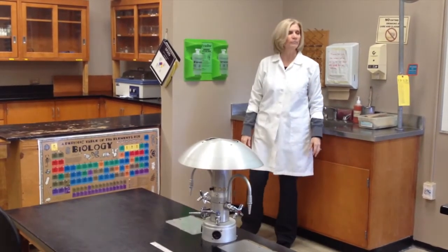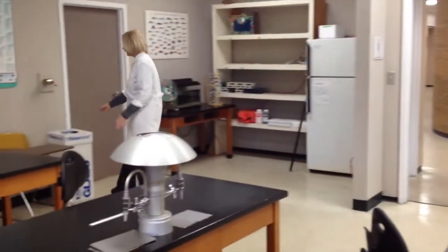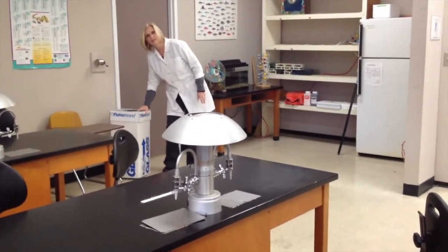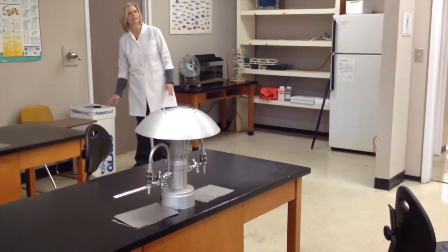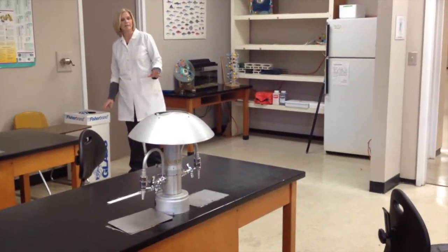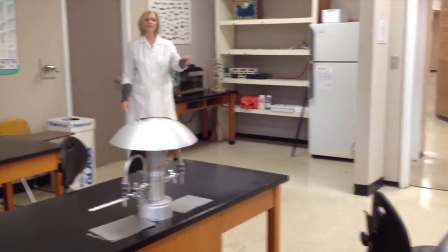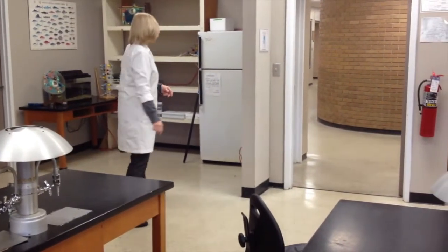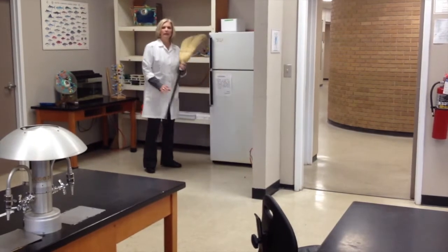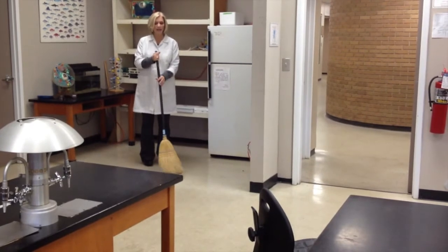We've got a broken glass container that is separate from normal trash. The glass container is over here. You can hear that there are glass pieces in here. If you break a beaker, test tube, notify your instructor. The pieces will go in this container rather than the typical trash, so they can be disposed of properly. The brooms, your instructor can be involved or control the cleanup.